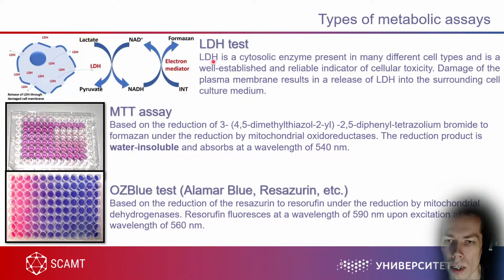But all of these tests mean that you need to destroy your cells to obtain some results. But in the case of resazurin test, again the principle is mitochondrial dehydrogenases, but after incubation with resazurin, you can further incubate your cells in your culture media. So this test is non-toxic, let's say.